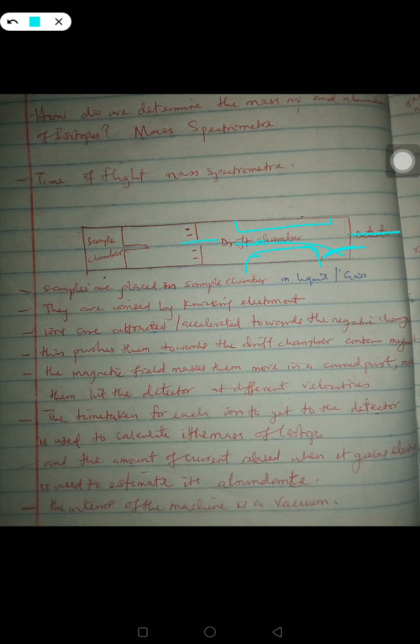Now there are two things I wanted you to take note of. I said the magnetic field makes them move in a curved path until they hit the detector at different velocities. That is very important. The speed at which they move inside this chamber is the same. They move at uniform speed inside this chamber, but immediately they enter into the drift chamber, they move at different speeds. It's very important you understand that. Here they move at the same speed, here they move at different speeds.